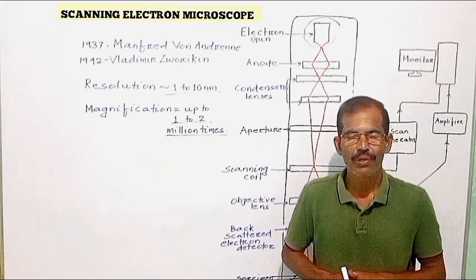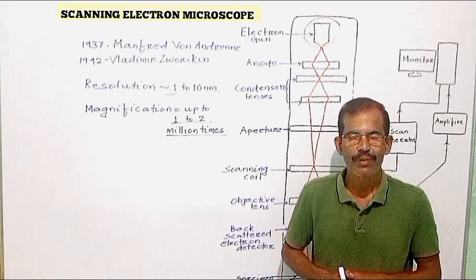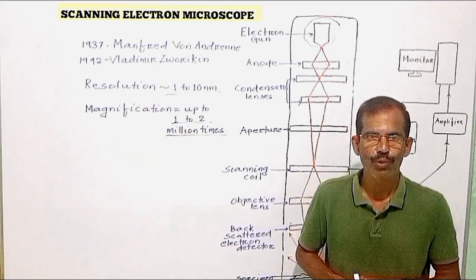Today we will discuss the principle and applications of scanning electron microscope.